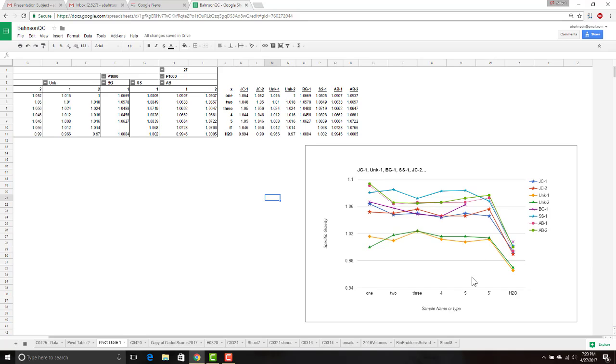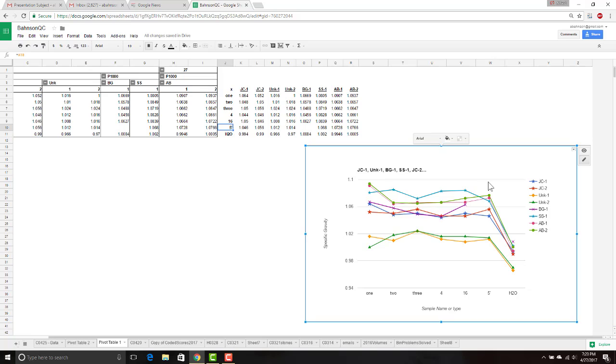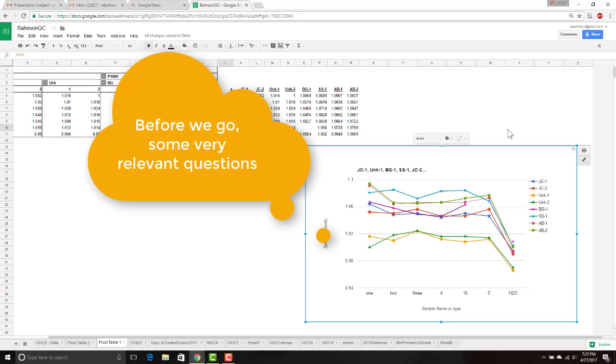Anyway, there's our labels, and the real thing I wanted to show you was if you change numbers to text, you can turn a graph from an XY line graph, an XY plot, into a series plot where these are always going to be equally spaced, and no matter what the numbers are, they're not going to move around because they're no longer considered numbers, they're considered placeholders or whatever, and they come equally spaced as integers in a series of things that are different from each other, and not related by their x values in any mathematical way. Okay, that's what I wanted to show you.